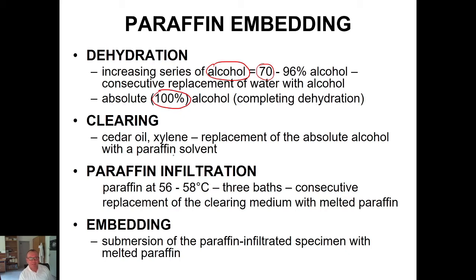Then clearing, mostly in xylene, which is a universal solvent of paraffin. Then paraffin infiltration, usually 3 baths, and proper submersion of the specimen in melted paraffin.